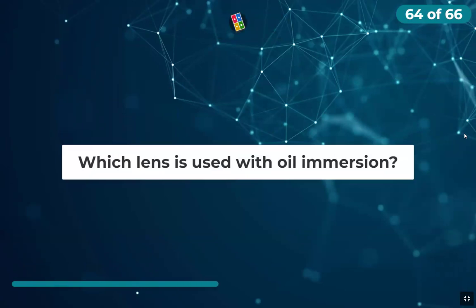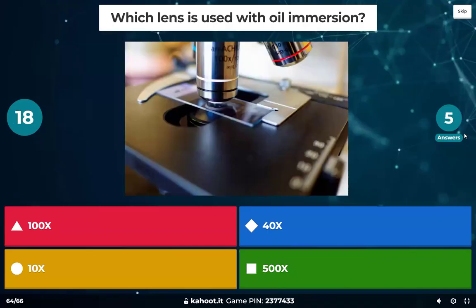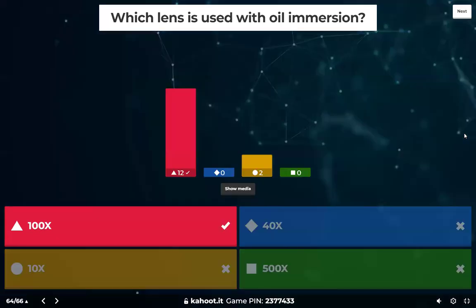All right, which lens do we use with oil immersion in our lab? It may or may not be in the picture. All righty, so that one is the 100x.